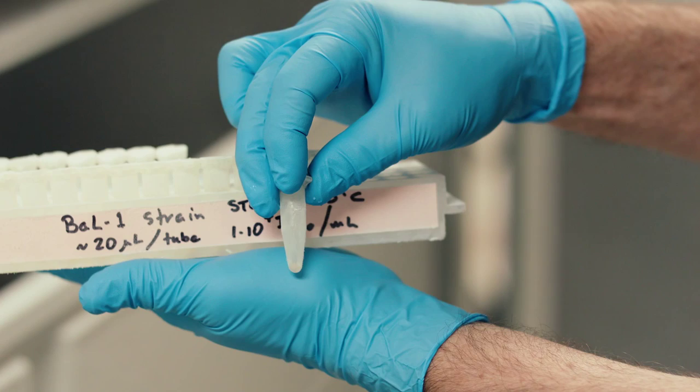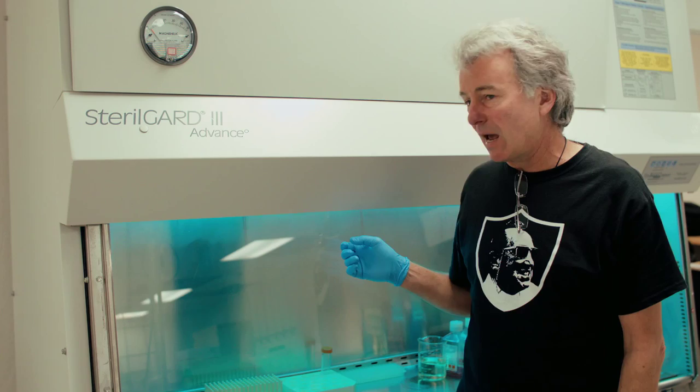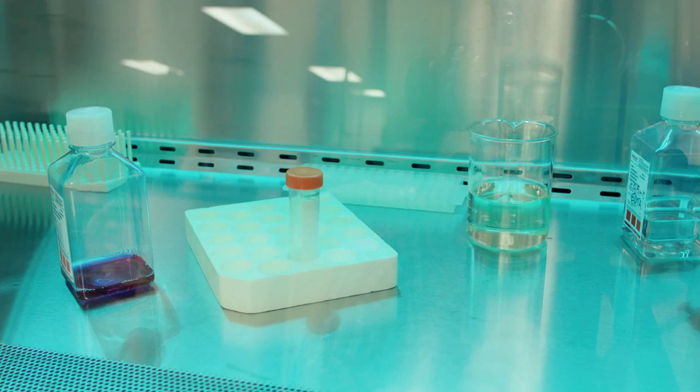We'll work with it in this biological safety cabinet. As you can see right now, it has a UV light on. And the equipment inside is being bathed and sterilized in UV.